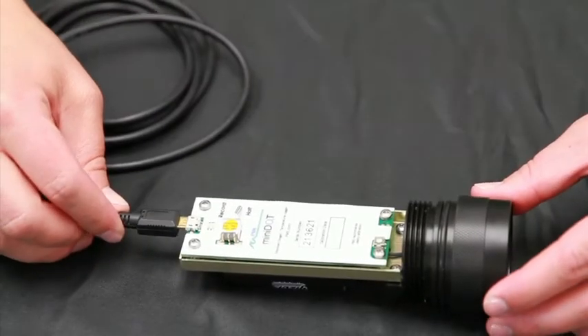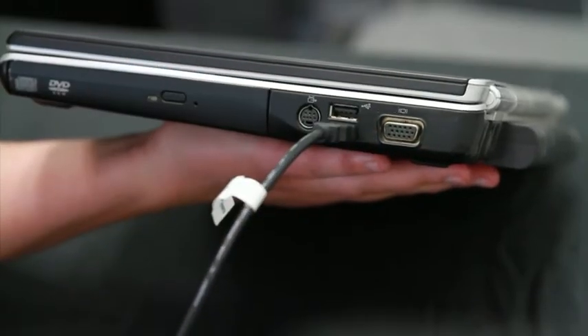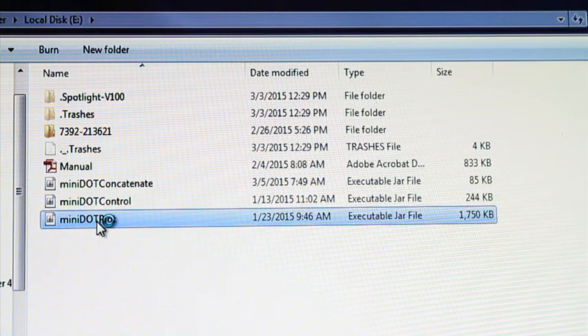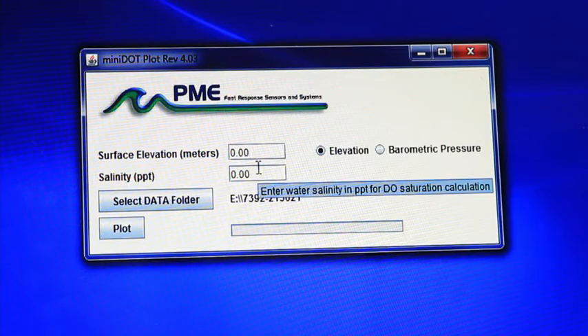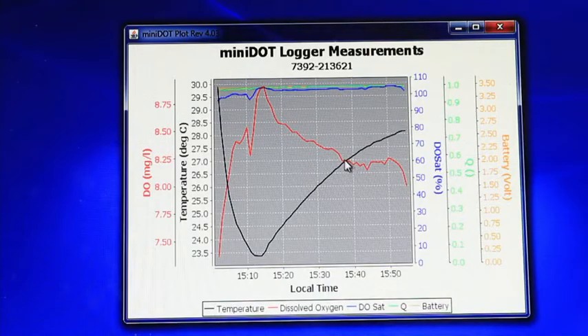Viewing the data is simple. Simply connect the mini dot logger to your computer using the USB cable. Run the mini dot plot program to see a plot of the measurements. Enter your known elevation and salinity, then click the button plot. You will see a plot of dissolved oxygen, temperature, oxygen saturation, quality, and battery voltage.